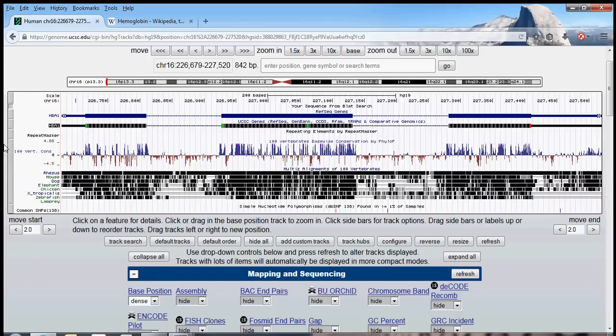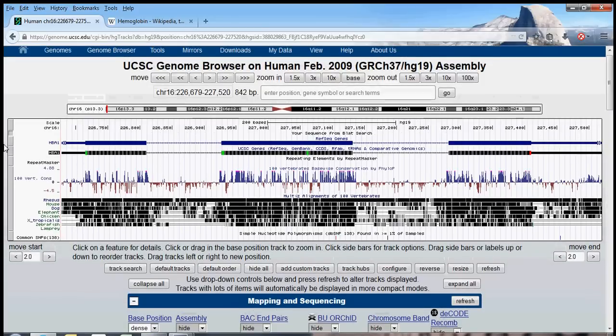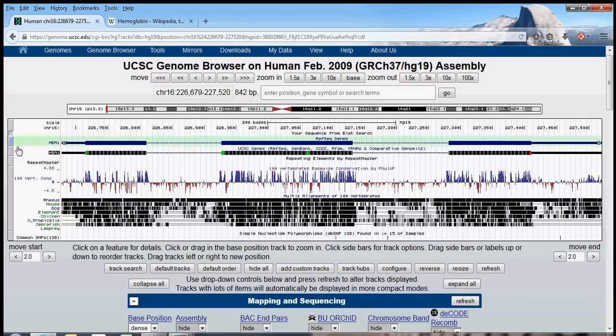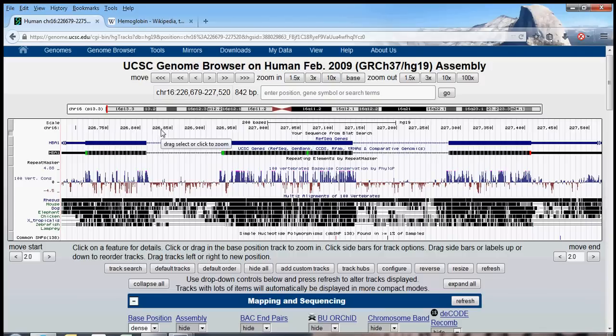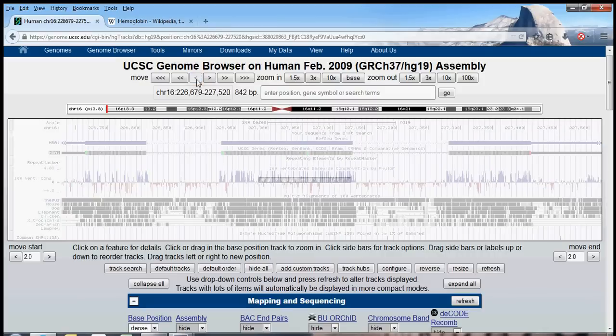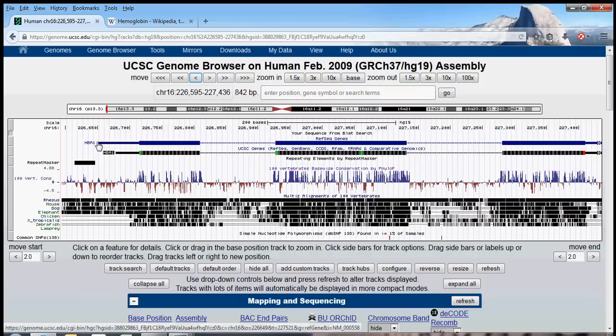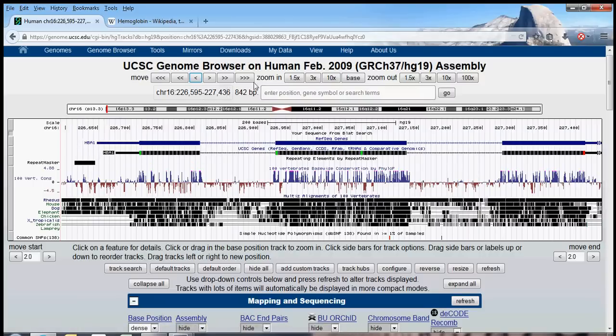So, first, why don't we just get comfortable manipulating the genome browser? There are a few ways to explore the finer structure of this hemoglobin gene. We can use the navigation arrows up here. For instance, if I want to move 10% to the left. Now, the start of my gene is a bit later in the window. Or, if I want to zoom in, let's say zoom in three times.